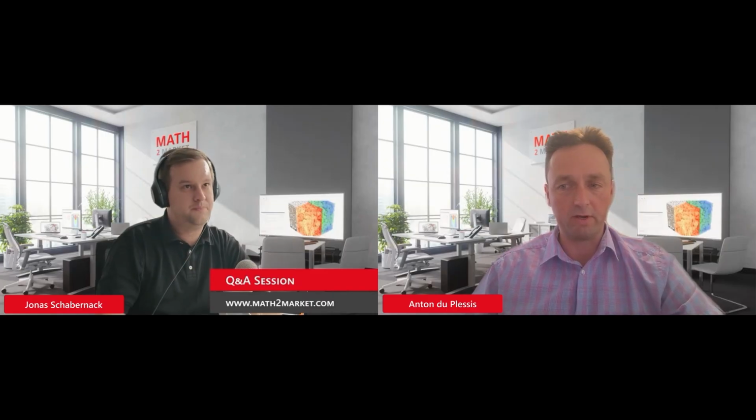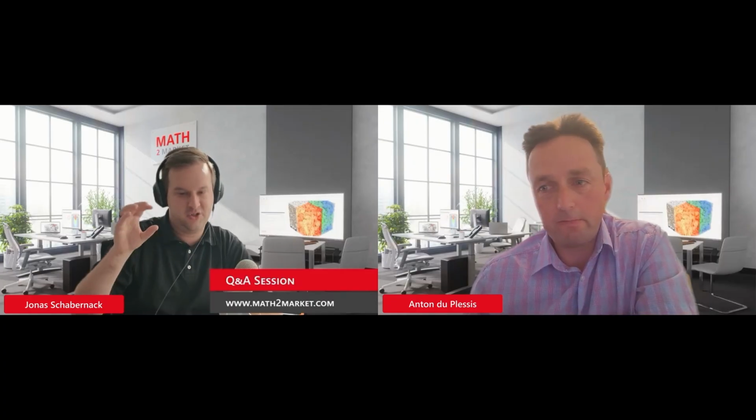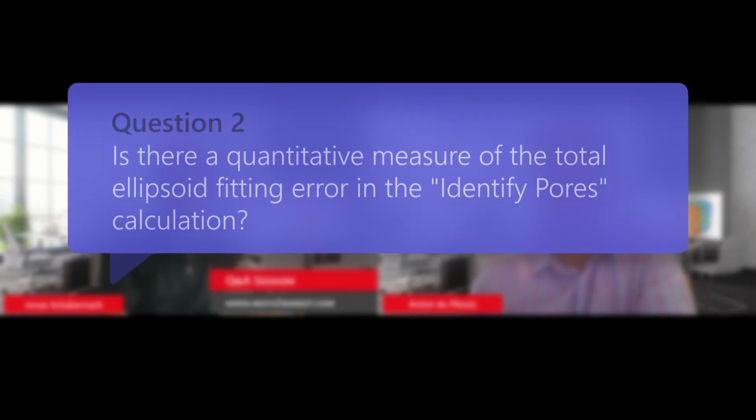Calculating representative elementary volume. No, not directly. It's of course possible, but you need to see it for the specific application that you want to do it for. It's of course possible to get subsections of the sample and apply it there and see at what point it becomes not representative anymore.